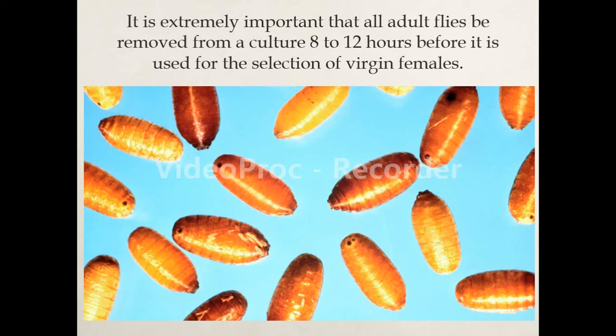Meaning, the embryo and larva are converted, then pupa, and then the adult mature fly. After this stage, for example, remove all the adult flies. Understand? Because at this stage it becomes easy to study the female characteristics of Drosophila. That's why the adults are removed from the cultures. Because if we mix them, the females can lay eggs, gametes form, and reproduction starts again, and we are unable to distinguish the females and the males, and unable to study the genetic traits of Drosophila and how they are transferred from parents to offspring.